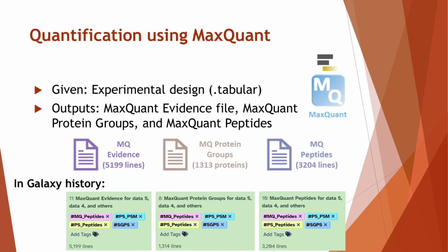For human proteins, peptides are shared within isoforms, so the protein group file reported groups of proteins that share peptides. For microbial proteins, protein groups are reported across organisms based on shared peptides. In order to perform data analysis of the microbial community in our sample data, we will have to extract microbial peptides from the peptide file.